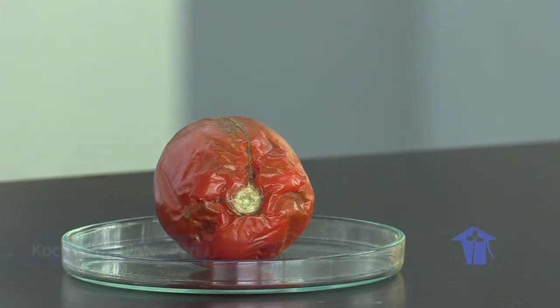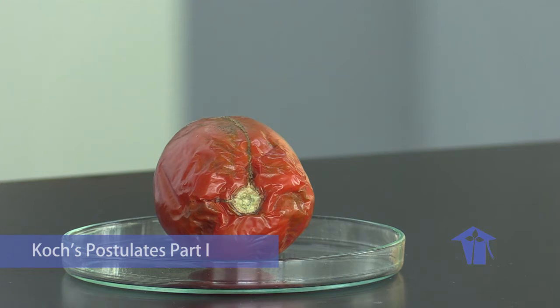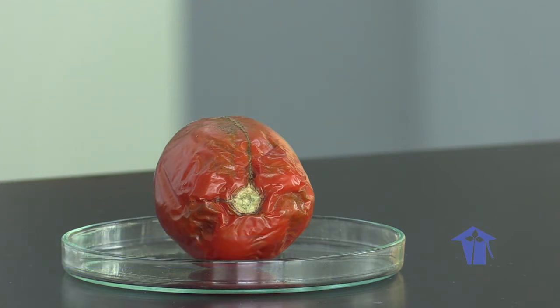So in today's lab, we'll be looking at Koch's postulates. It's a 4-part lab, so we'll be doing 4 different sessions to go through the entire experiment. Just a bit of history.